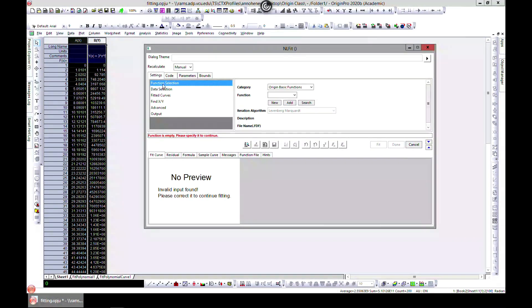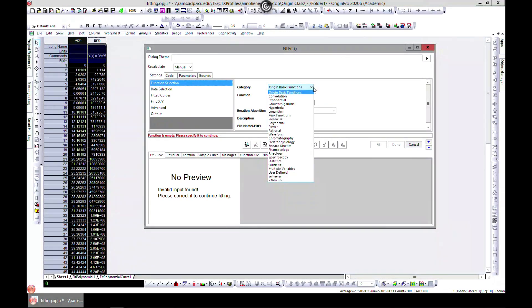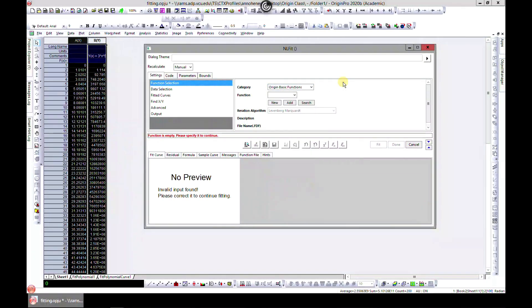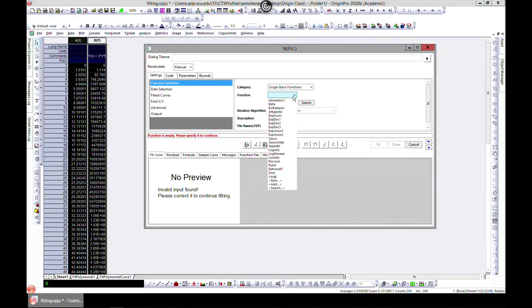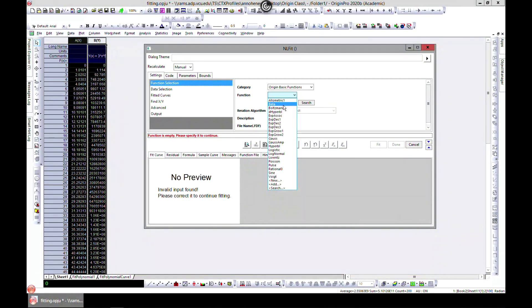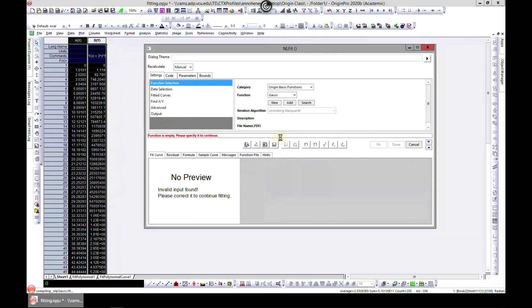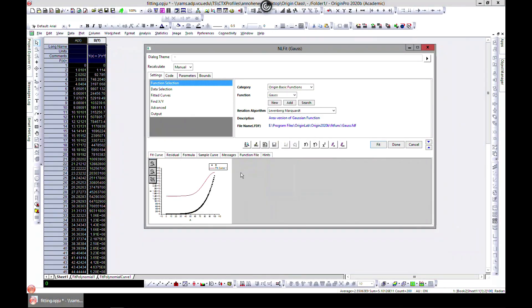select your function. Origin has many basic functions - that's a category. You can come to Function and see some of these functions that Origin has already provided. Let's say we want to do a Gauss.